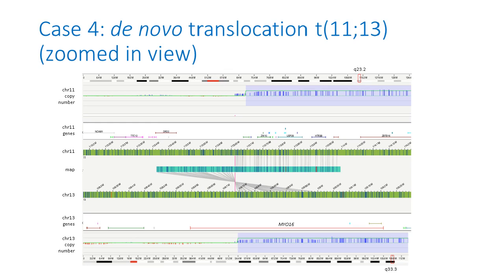This translocation is interesting. It's associated with a copy number gain on both chromosome 11 and chromosome 13. This slide shows the mapping of the breakpoints at both chromosome 11 on the top and chromosome 13 on the bottom. We can identify the location of the breakpoint, and in the lavender color, the copy number gain on chromosome 11 and chromosome 13.